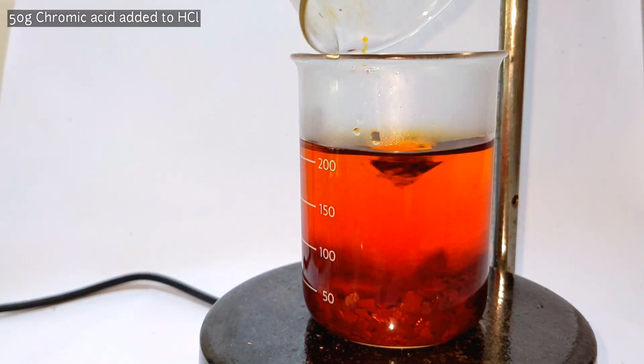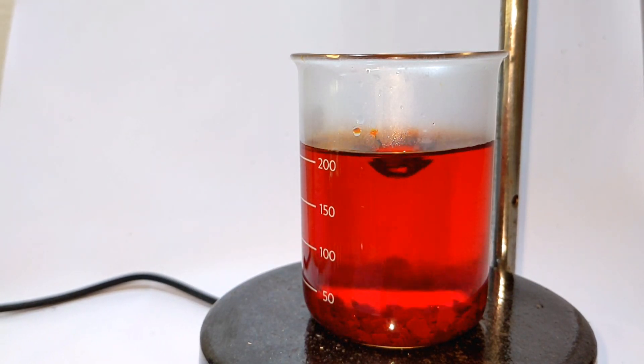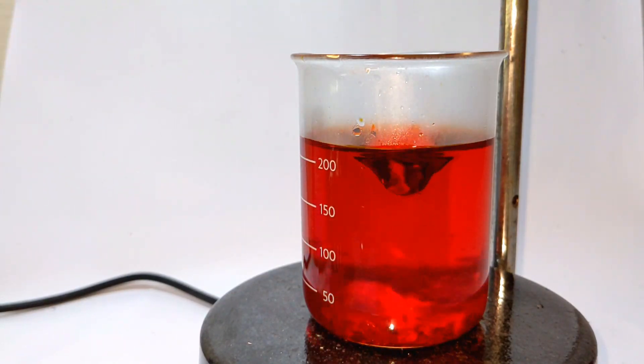184 milliliters of 6 molar hydrochloric acid is taken in a beaker. With continuous stirring, 50 grams of chromium trioxide is added to the acid. Stirring was continued until all the chromium trioxide dissolves. The resultant solution is the chlorochromic acid, which has a deep red color.